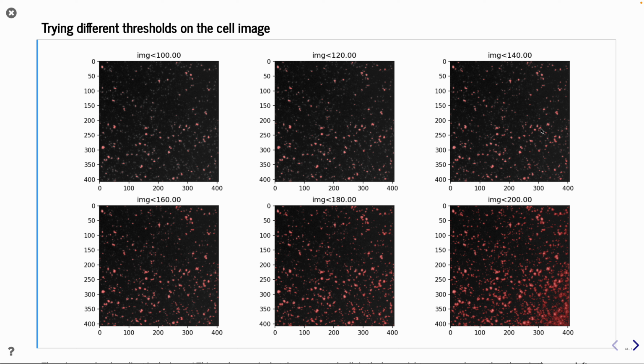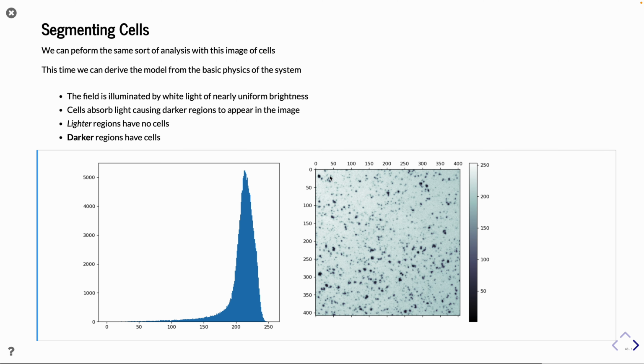And that is an effect that we can observe in the following images here. And in this case, it's extreme. You can see really there are big blobs and most likely also misclassified false positives, quite many. And the reason for that is that we have a gradient in the intensity across the image. So it's, I would say, a diagonal gradient, and that is what gives us the problem. After the break, we will look at a method to correct for this, but for now we just state the fact that we have a problem.